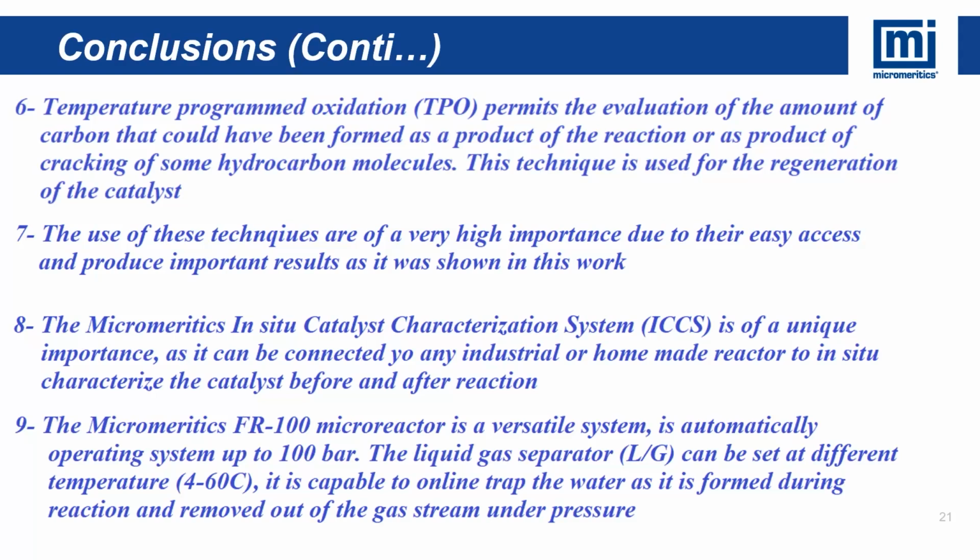The use of these techniques is of very high importance due to their easy access, so everybody can have them, unlike other techniques, for example, spectroscopic techniques using ESCA or XPS, whatever you like. It's not that easy to access them, because it's a much more expensive system.